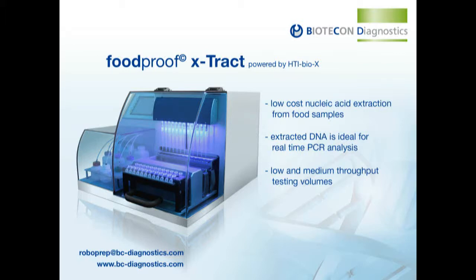Welcome to Biotecon Diagnostics video presentation of the new Foodproof RoboPrep Extract. This new technology provides a fully automated pipetting solution at low cost for bacterial nucleic acid extraction from food samples. The compact RoboPrep Extract is suitable for low and medium throughput testing volumes.